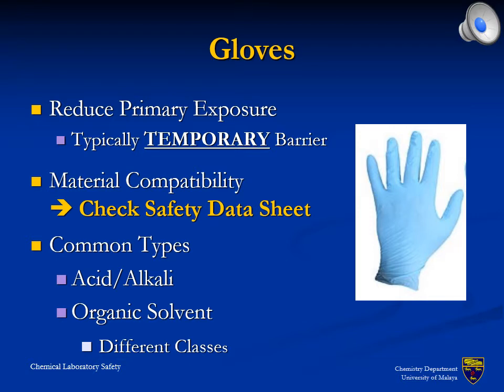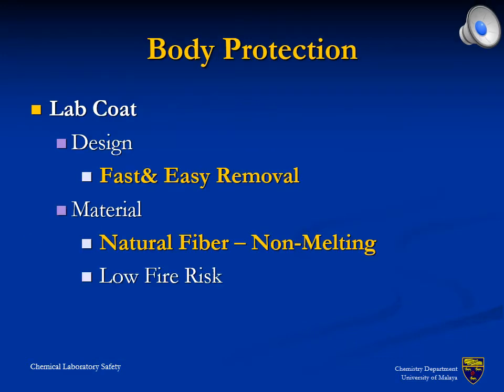Gloves worn for a long time cause problems, because an exposure to the glove might not be noticed owing to the sweating inside the glove. The use of a lab coat is mandatory inside a chemical laboratory. The major protection function is the easy and safe removal of any upper lab clothing. A lab coat can be removed within a few seconds without exposing the eyes, since it does not have to be pulled over the head.